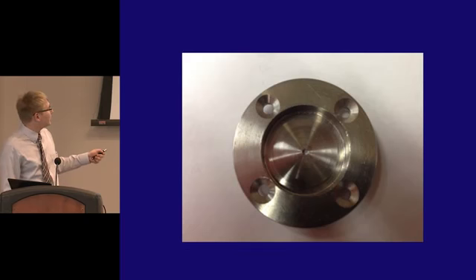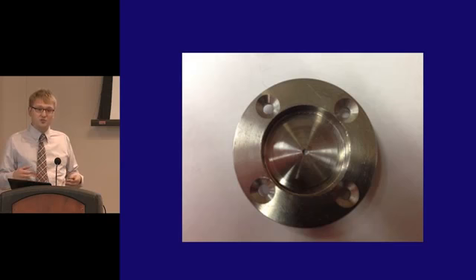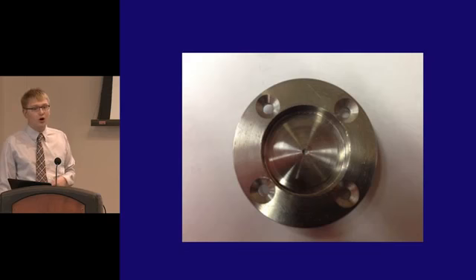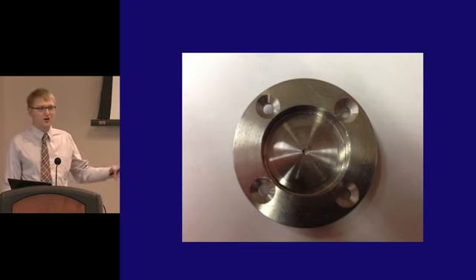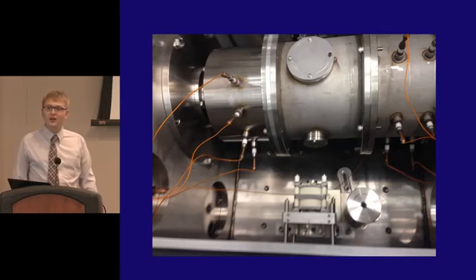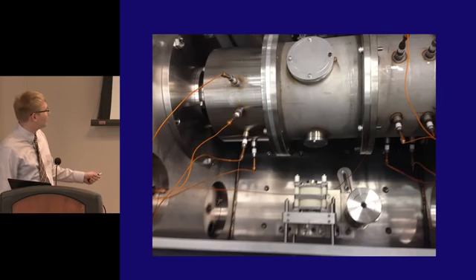All the ions must pass through this small hole in the middle. They're focused by the ion guide to permit almost all of them to pass. However, the hole will only permit a small amount of ambient gas to pass as well. Once we pass through about 4 of these, we'll go all the way from room pressure to our 1/billionth of 1 atmosphere. So here's a picture of the ion trap installed and ready to run.